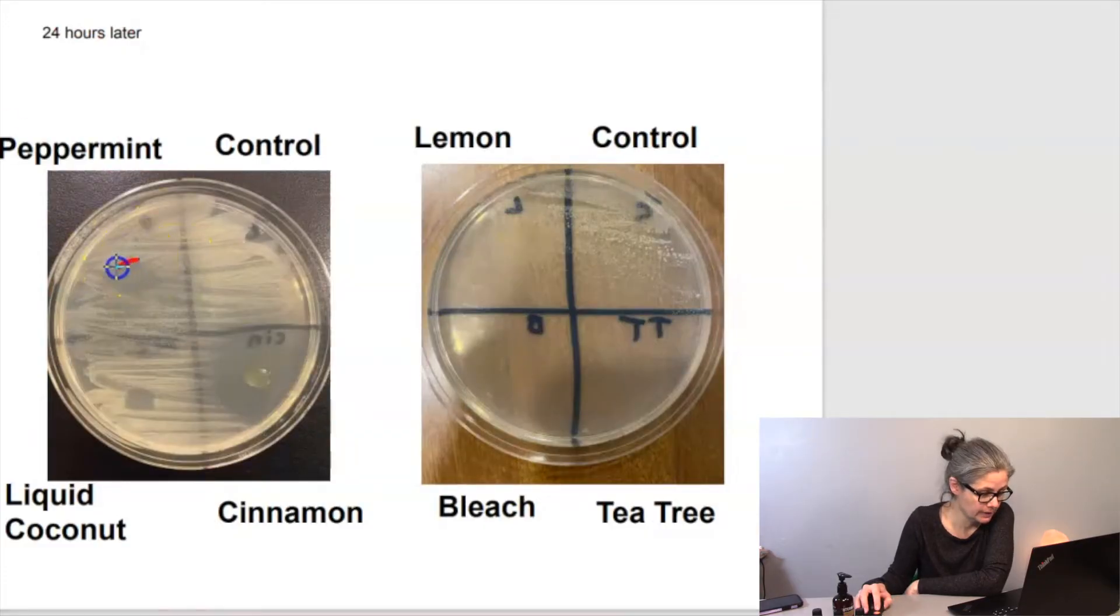So look at here, the peppermint, right where I put the one drop, there's no growth at all. That's super cool. Right here, where I put one drop of the liquid coconut, there's no growth either. The control is total growth, which is great.